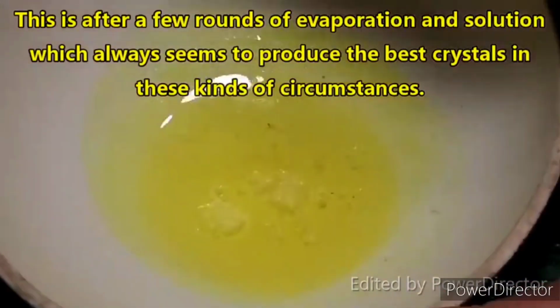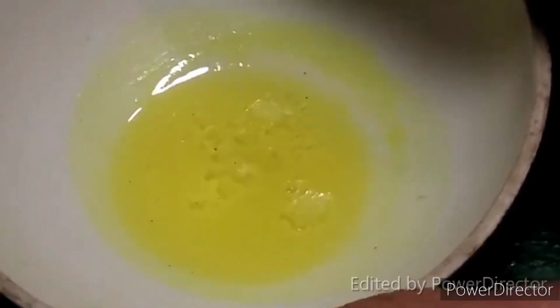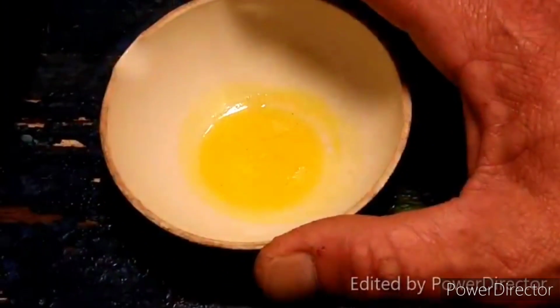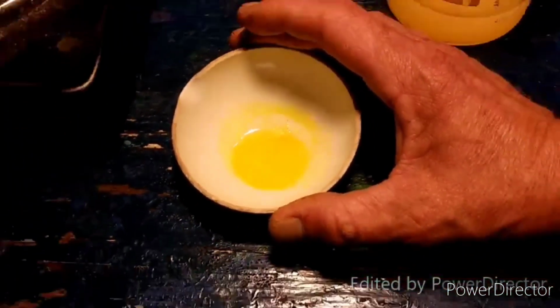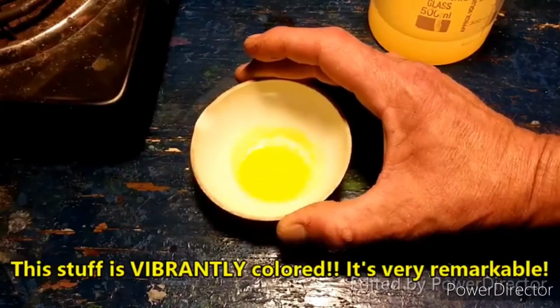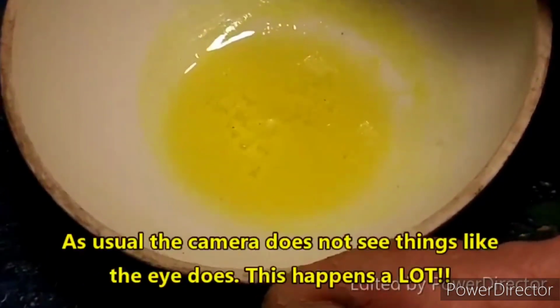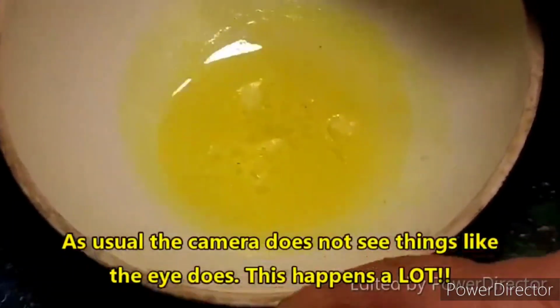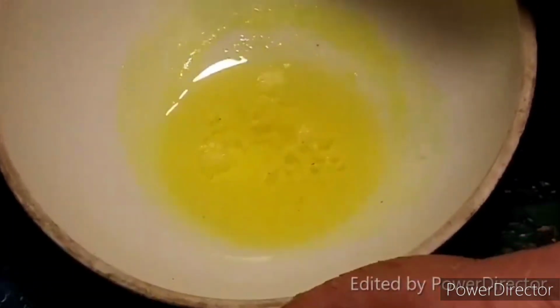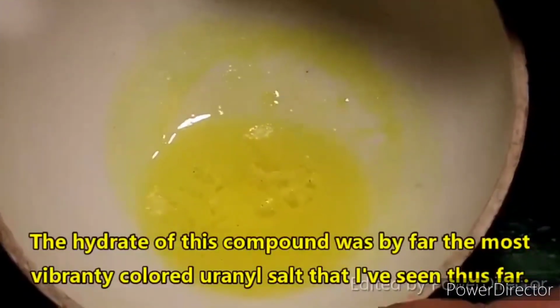Okay, everyone, so here we've got the cesium uranyl chloride. It is starting to crystallize. You can see we've got some nice crystals of it there floating on the surface. The camera does not even begin to do it justice. In the camera, it looks very pale. Maybe if I zoom out here, it just really doesn't get just how brightly and intensely colored it is. It is a very intense yellow, and the crystallized stuff has almost a greenish tinge to it. Look at that. That is beautiful.